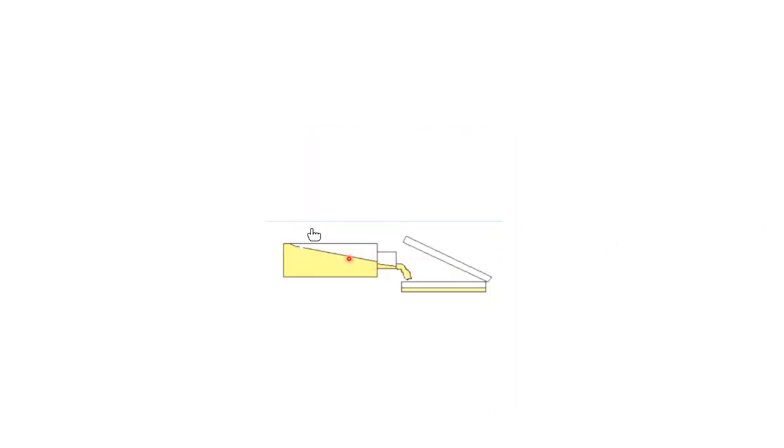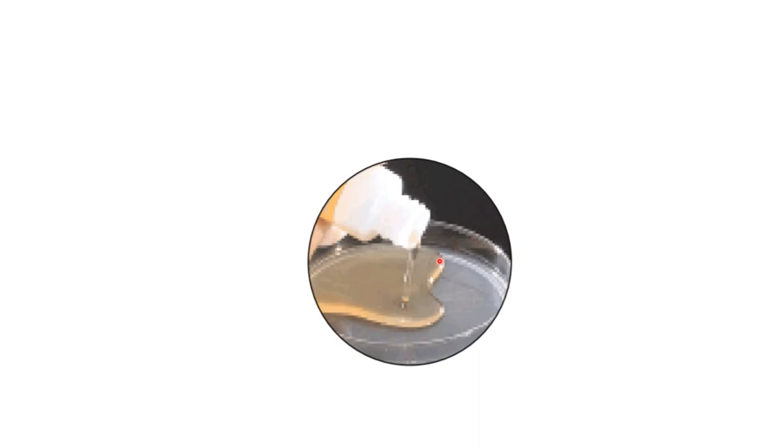This is showing that they should have had this tilted up a bit more. And you want to pour it until it's completely covered the bottom of your agar plate, but you don't want it filled to the top, because if it's filled to the top what happens is the top glues down. The smaller piece is the bottom and the top is a larger piece so it covers over. Two millimeters thick, this is maybe I'd say a third full is about right. Now this would not be enough. It's got to be poured until it's about to this level here.